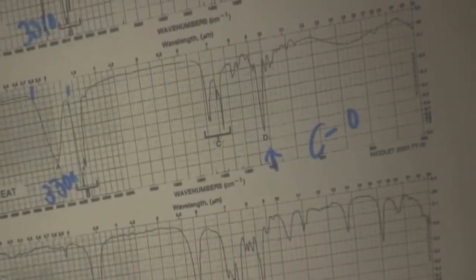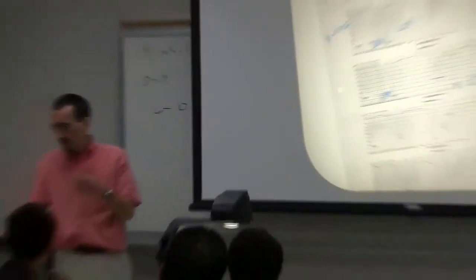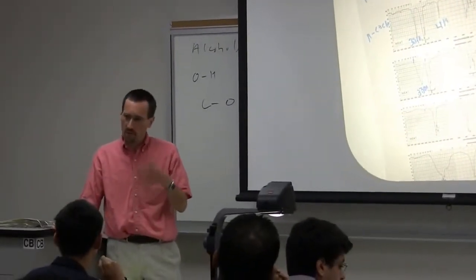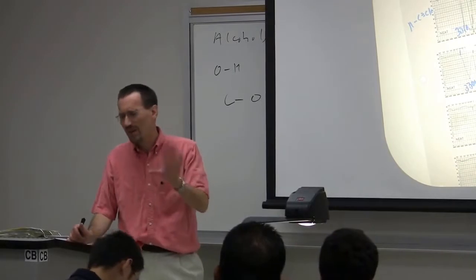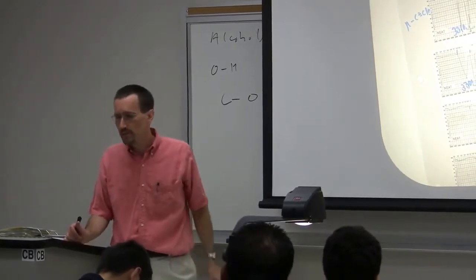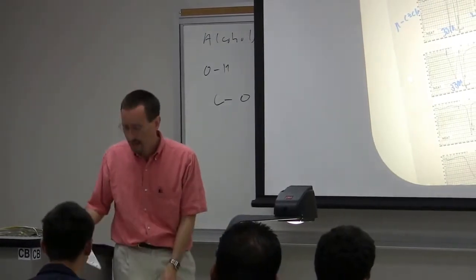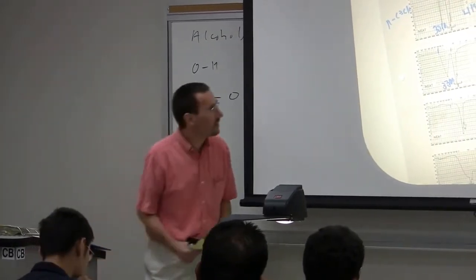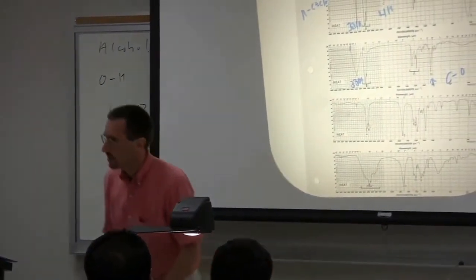Remember, the CH stretching modes are much stronger, much higher frequency. Those are at about 3,000. The CH bending modes are at about mid-1300s to mid-1400s, and you have the asymmetric, the in-plane and out-of-plane bending. There are actually things you can discern in this region.